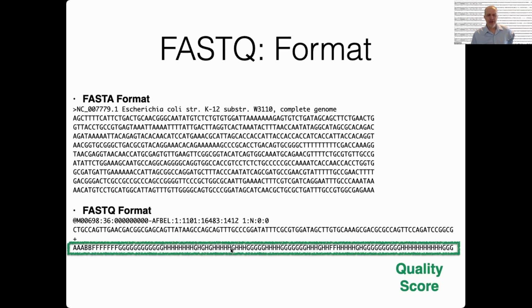And so there's an algorithm for converting from an A or an H or a G into an estimated probability of error. We're not going to talk about that. I have some links from the website to a worksheet that goes through it. It's not that complicated, but I don't have the time to go through it today.